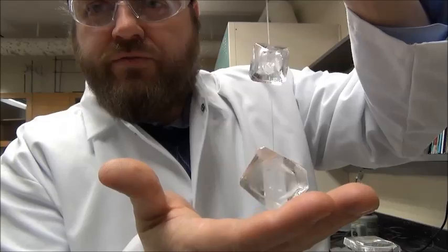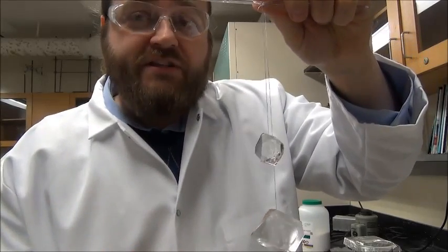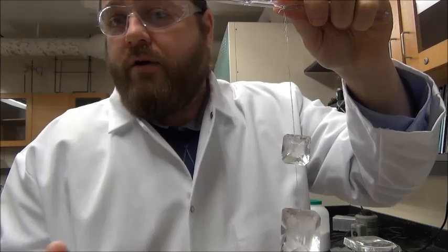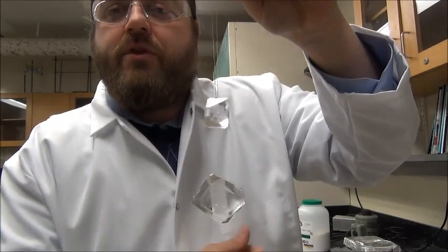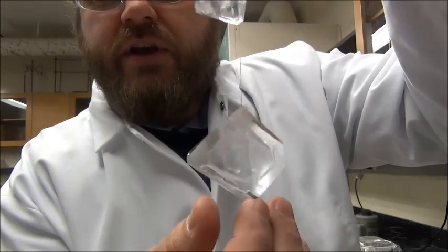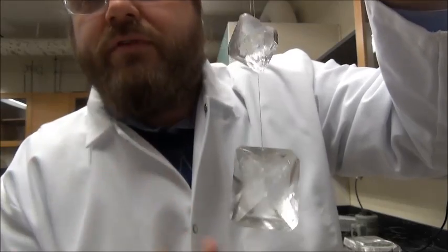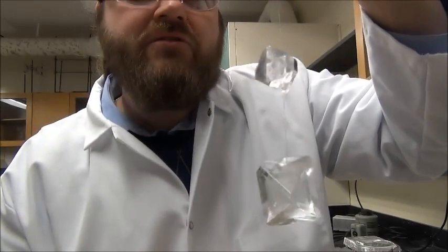Hi. So you clicked on this link, hopefully because you're interested in growing a large single crystal. The two videos that are part of this series are going to show you how you can basically transform 100 grams of a crystalline powder — something like potassium aluminum sulfate or maybe copper sulfate — into big, beautiful single crystals. These two videos are going to show you how I grew both of these crystals over the course of about six weeks.